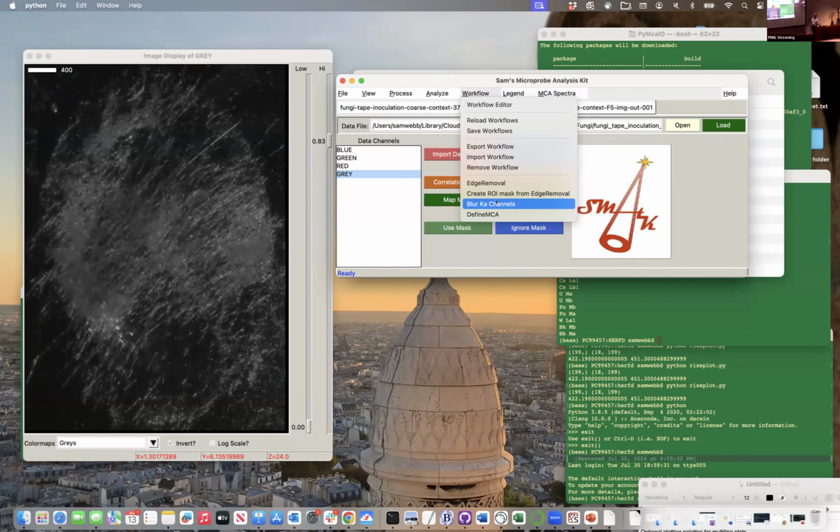If you were paying attention when I was showing you samsxrays.com, there's also, in a section after installation help, a section for workflows. It really just has, hey, there's workflows now, please share. And that's where we are right now. So I'm hoping that as we develop more workflows, and as people come up with workflows, they decide to share them, because they are exportable and importable.